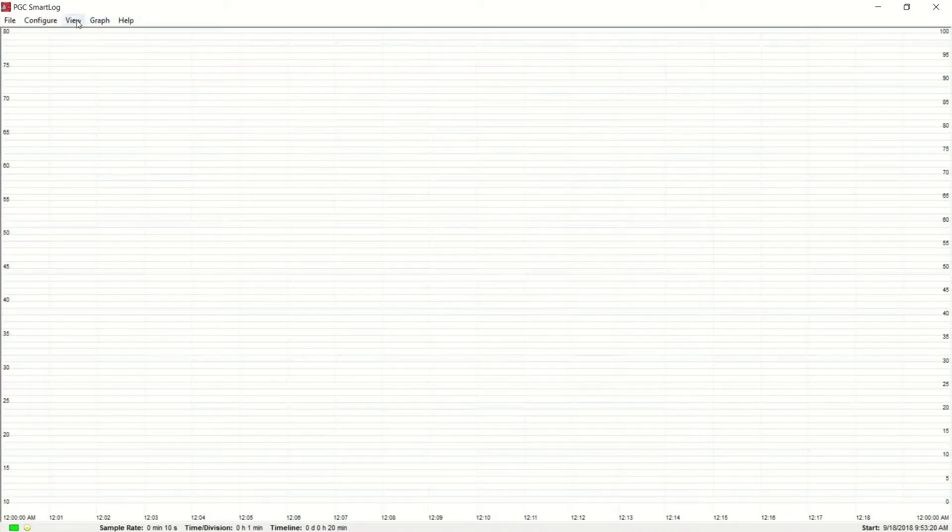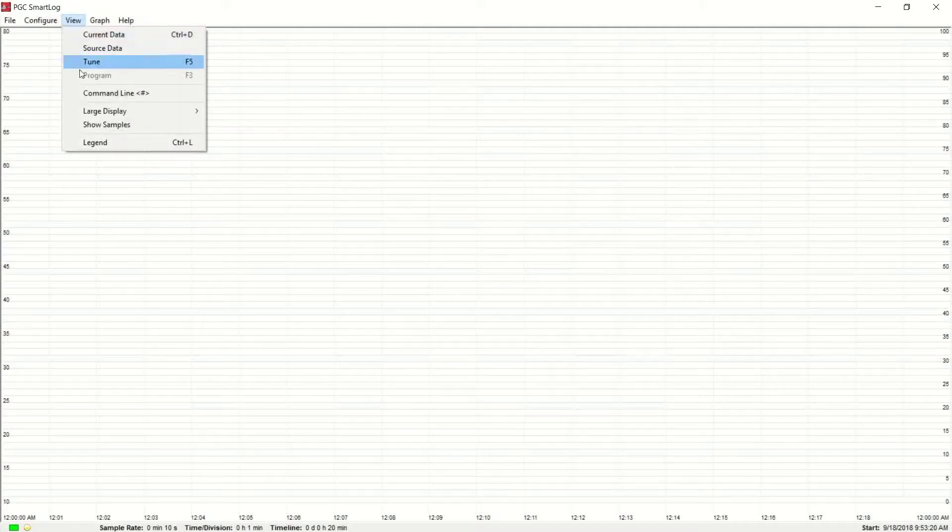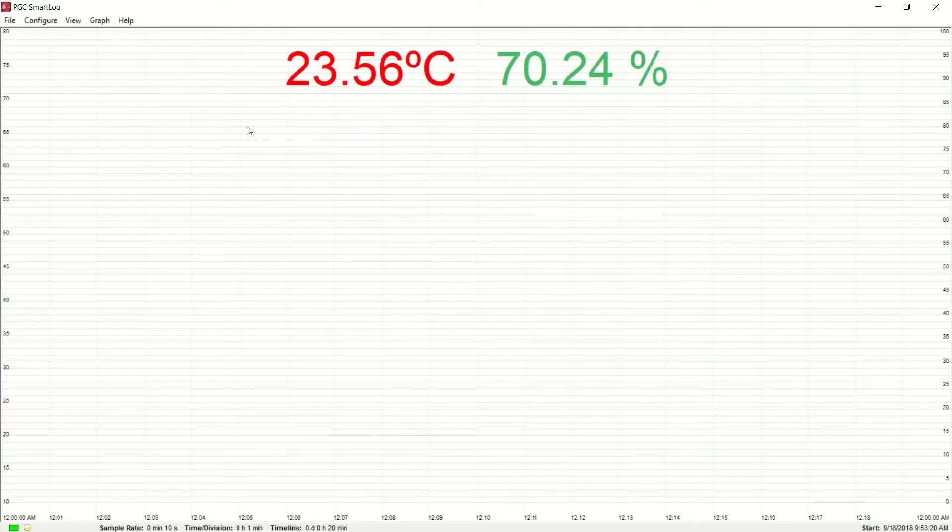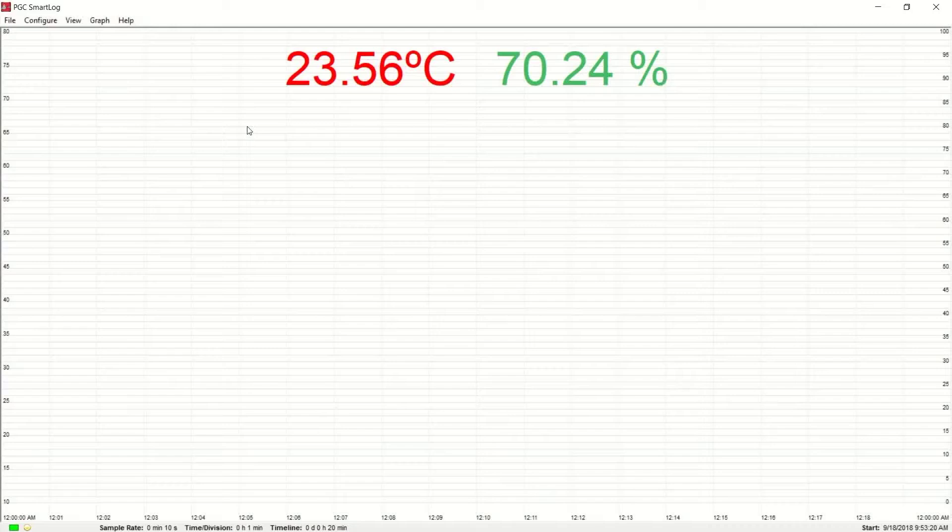Next, click on View in the toolbar and go to Large Display. Select Large Variable Display. This will display your measured temperature in red and your measured relative humidity in green.